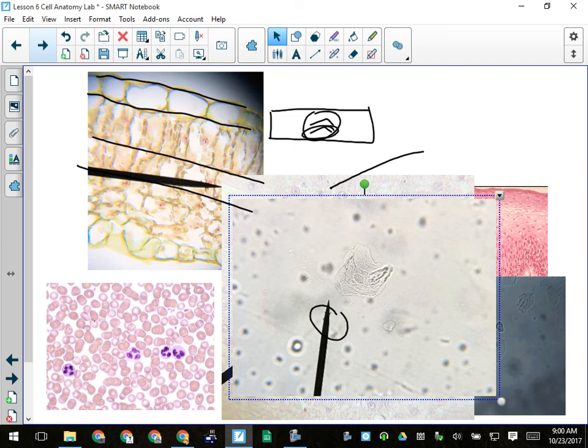We have a little more time today than we had last time, so we shouldn't be pressed for time. Jackson. That question's already been asked. Use as many cells as you need to label the structures you think you can see. And make sure that when you take your picture, you take it on the highest resolution possible on your phone. That way you can blow it up more when you're making the lab drawing, and you'll see a few more structures.